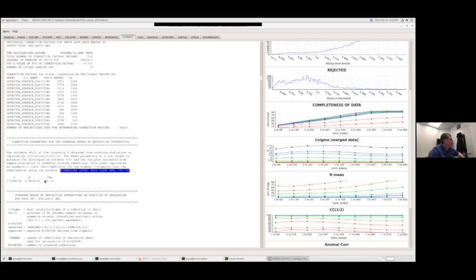But basically, they tell you that if you have something above a 20, you have a pretty good data set with no significant systematic error in it. And that systematic error may be because of something with your crystal, but it also may be because of something with the beamline.